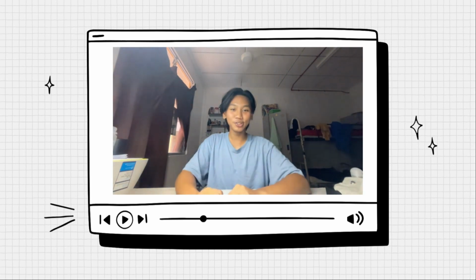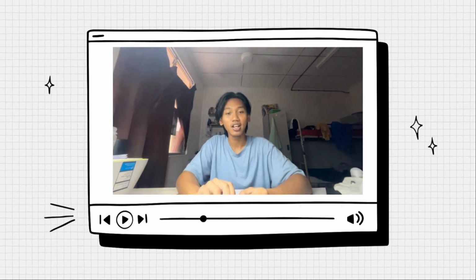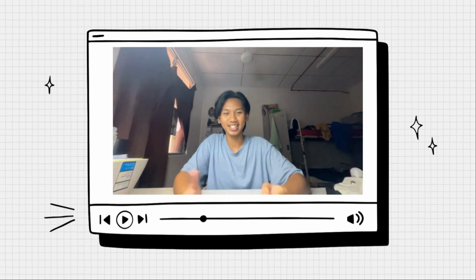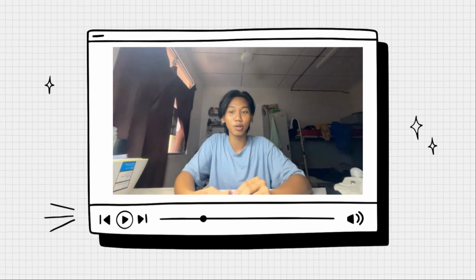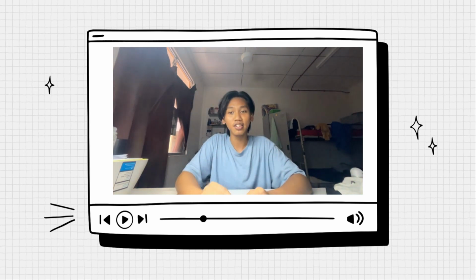Hello everyone. Today we are going to explore an essential analytical technique known as ultraviolet visible spectroscopy, or UV-Vis. This method is widely used in chemistry, biology and material science to analyze the absorption of ultraviolet and visible light by a substance. Understanding UV-Vis can help us identify compounds, determine concentrations and study reaction kinetics.